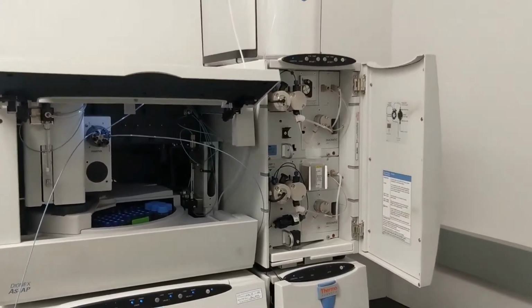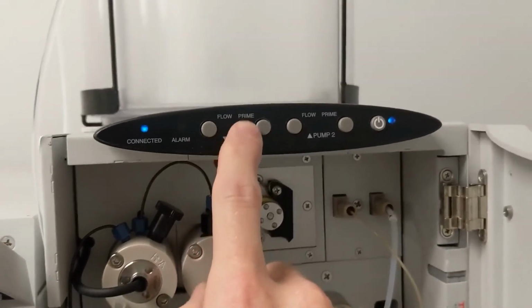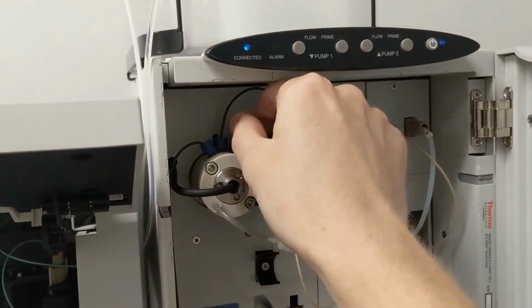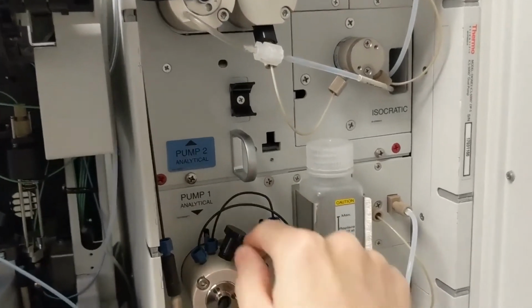Okay, so our pumps have finished priming, and we know that because the little blue lights up here that say prime are not lit. So we're going to close our purge valves right now. Now, you don't want to close these too tight. Just enough to be snug, just as soon as it catches, that's tight enough. It does not take very much.